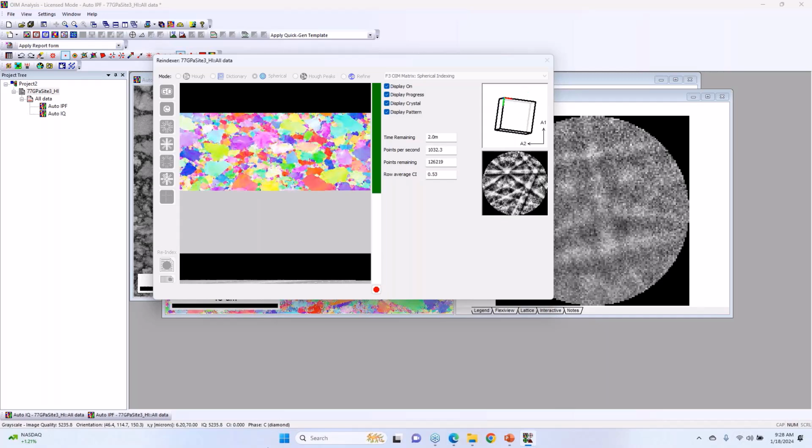Now, the flip side is, if you're new to EBSD and you hear this answer, we can make it look pretty complex: yeah, you just do this, and this, no problem. Again, we point to training courses and things to help address it. But the way I like to describe it is that OIM essentially grows as you use it. As you start to have more questions, the answers are built in there. There are tutorials and help files that make that really accessible. That's the reason you'll see a lot of these options. Like I described with the cobalt and the diamond, we can imagine there are times where you want two different backgrounds, and that's when that would come into play.